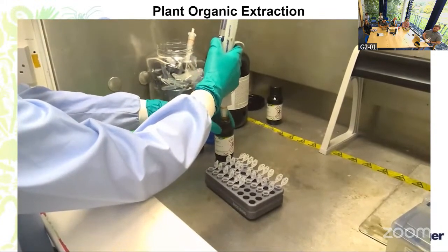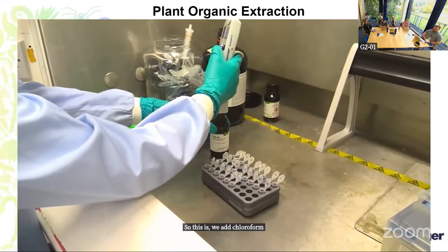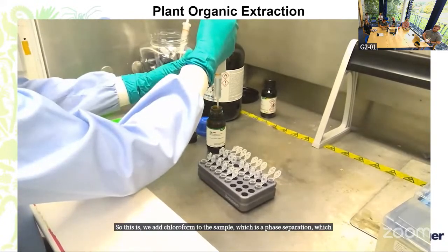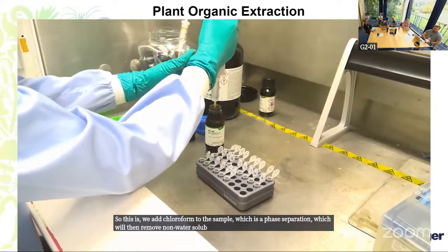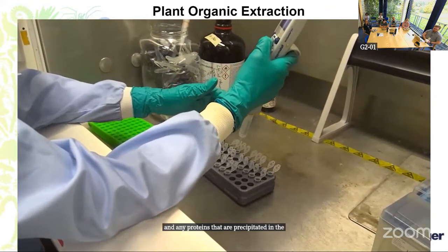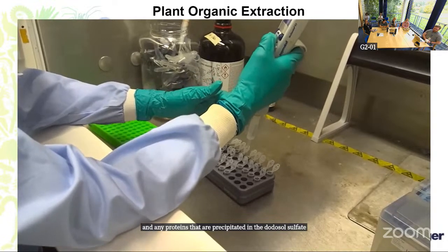So we add chloroform to the sample, which is a phase separation that will remove non-water soluble contaminants and any proteins that are precipitated in the dodecyl sulfate acetate precipitate.